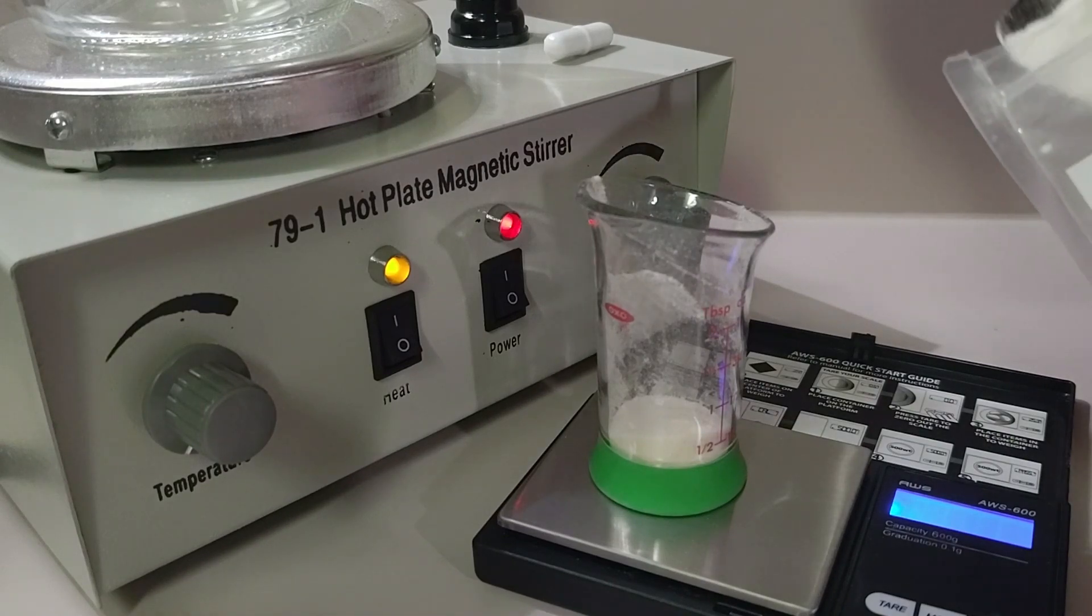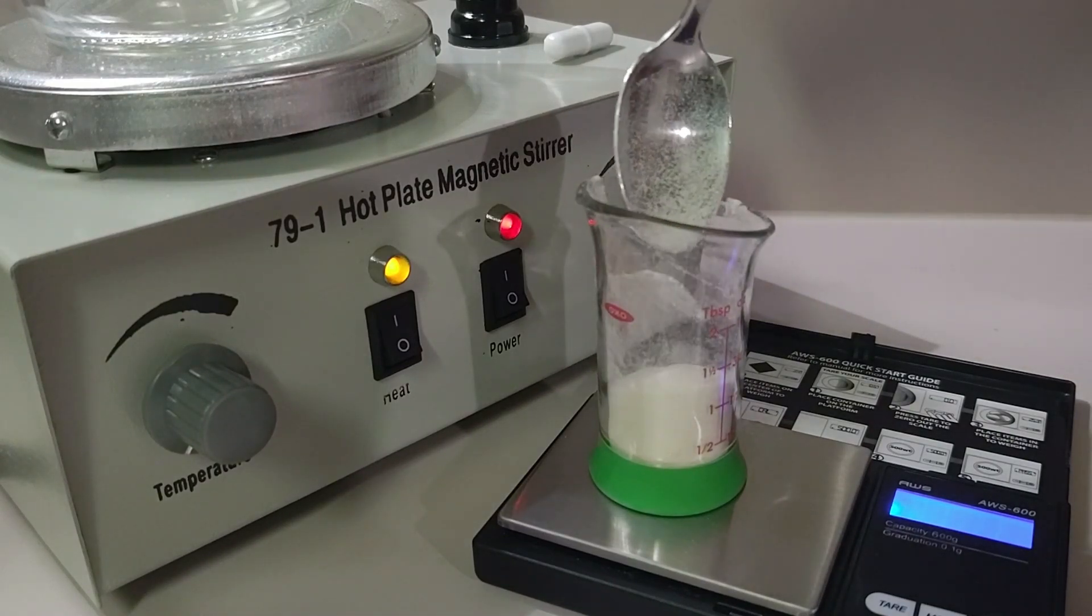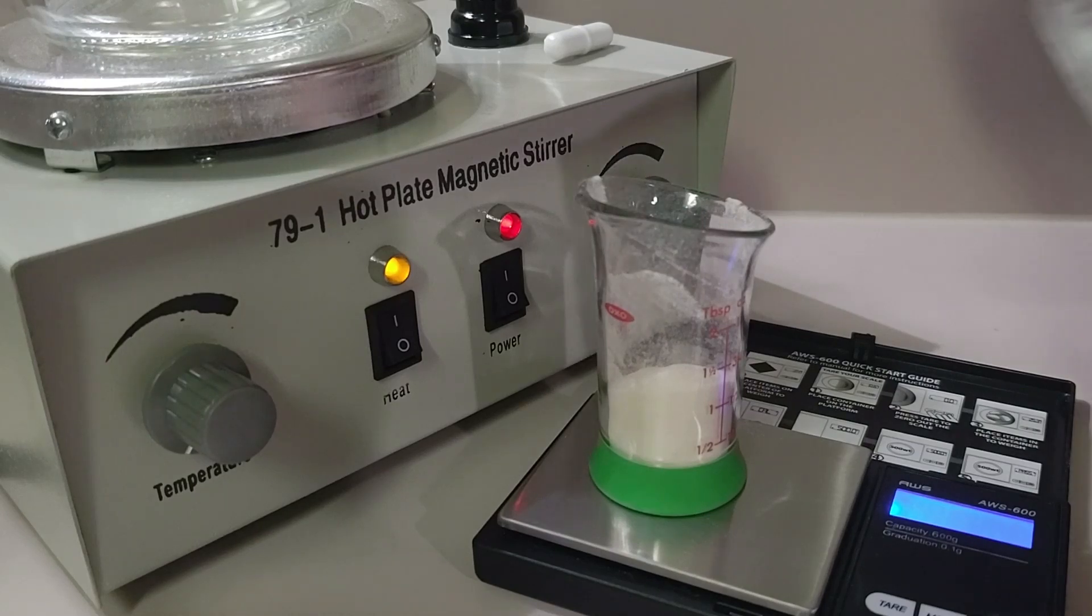In our last video we shared an easy way to get started using MEA which is a blend of malt extract powder, agar, and purified water that contains dextrose. Dextrose is a plant-based simple sugar.